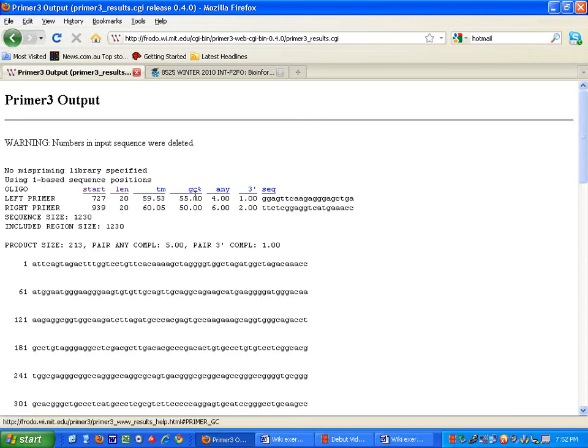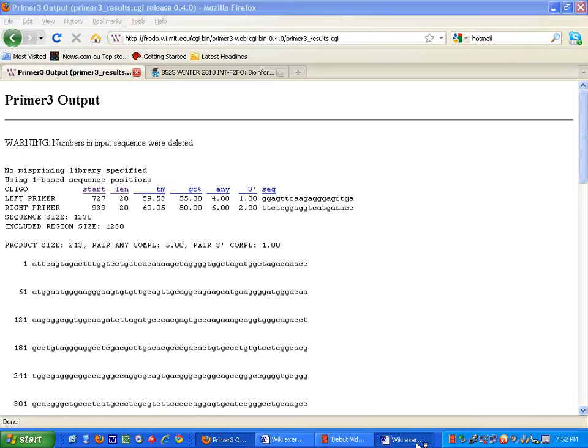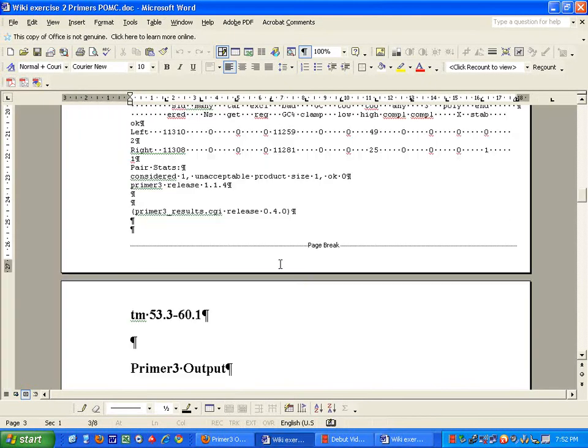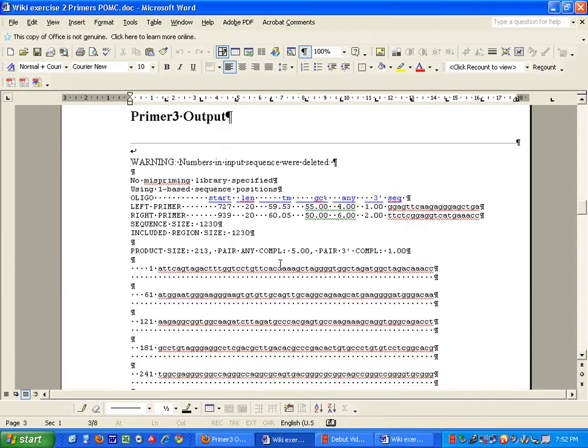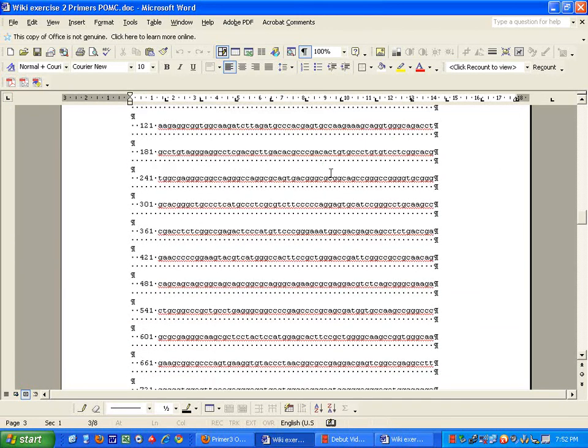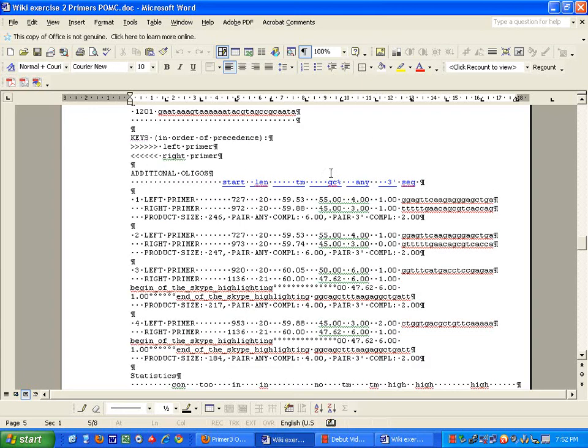It has generated very similar... Actually, it has generated the same primers as it was from the original. As you can see here, I have pasted that up. And you can compare that to just running it on default.